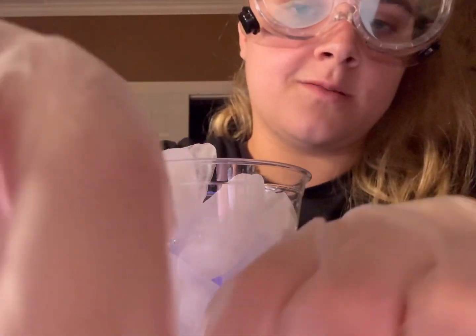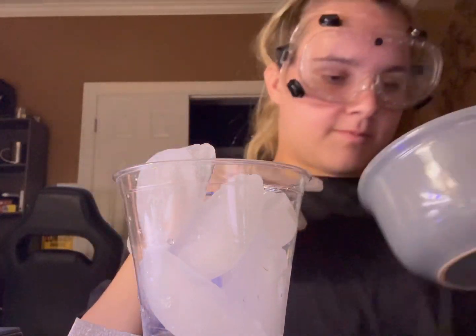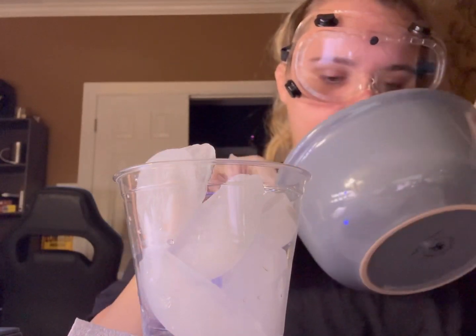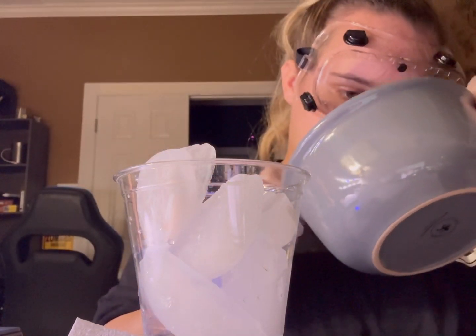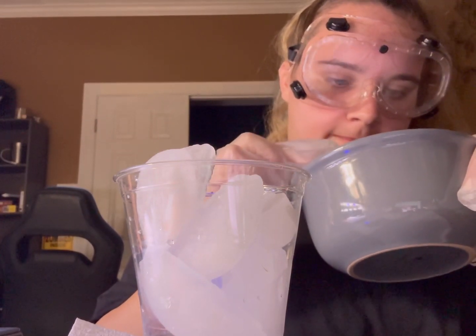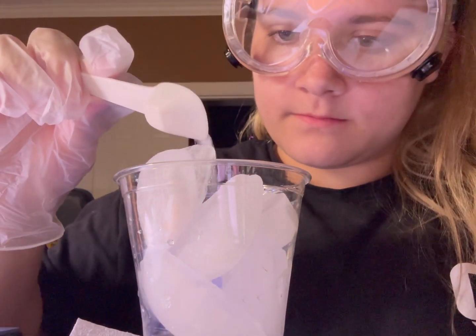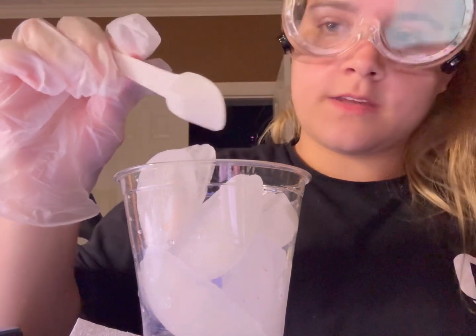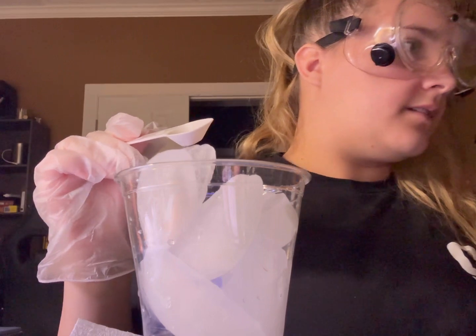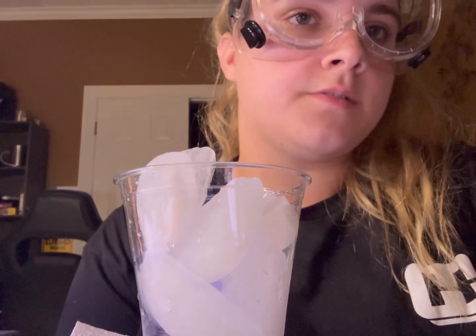So that is 100 grams of ice, and now we need half a teaspoon of salt added to this ice, and see how it affects the freezing point. So let me try to get half of it. Alright. So this should be half. And now I'll add 25 milliliters of water to this. And then I'll time it for another 10 minutes and 30 seconds and show y'all the results.